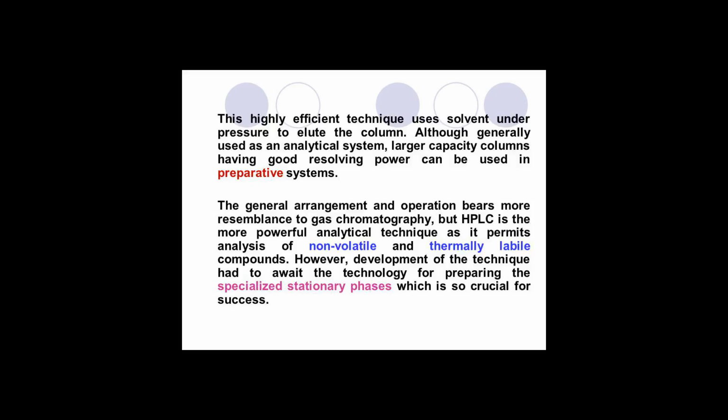For this reason, most methods use a buffering agent, such as sodium phosphate, to control the pH. Buffers serve multiple purposes: control of pH, neutralizing the charge on the silica surface of the stationary phase, and acting as ion pairing agents to neutralize analyte charge. Ammonium formate is commonly added in mass spectrometry to improve detection of certain analytes by the formation of analyte ammonium adducts.